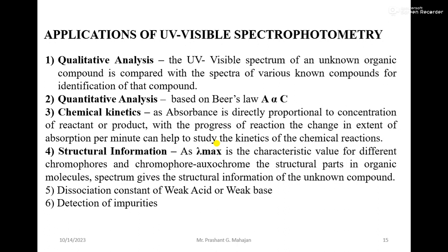First is qualitative analysis. What does qualitative analysis mean? Depending upon the lambda max, you are going to say this is the compound. So qualitative means you are going to say the name of the compound. That is called qualitative analysis.